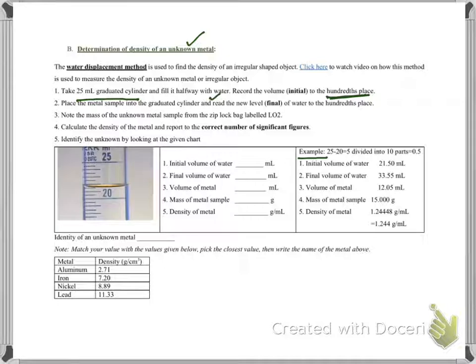So let's look at, I have put one picture here. If you look here, this level of water here, it is between, look at the big marks, 20 is here and 25. These are my big marks. So first, I have to find out how much each small part is worth. So first you do 25 minus 20, which gives 5. 5 is divided into 10 equal parts.